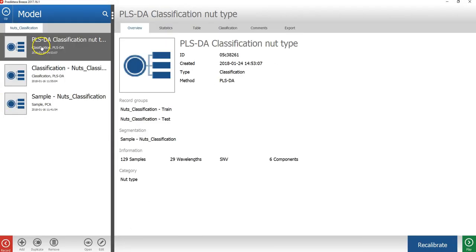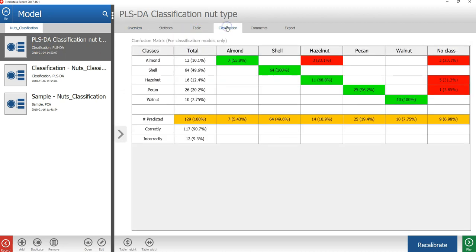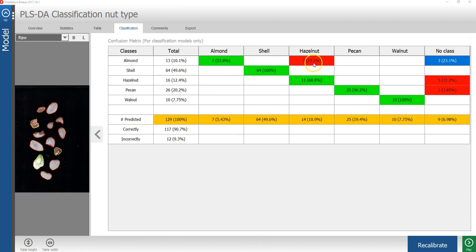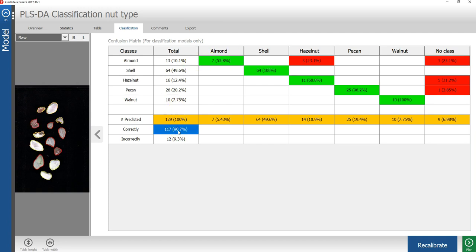With the new classification model selected, I will press the classification tab. Here I can see how well the training data was classified by the PLSDA model. For example, we can see that of the 13 almonds, 3 has been classified as hazelnut. 3 has been classified as no class. In total, 90.7% of all the nuts were correctly classified.